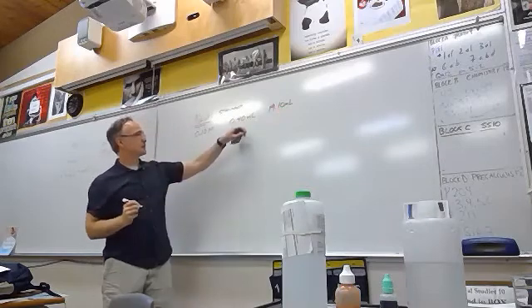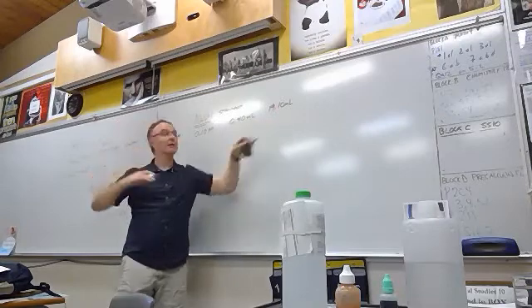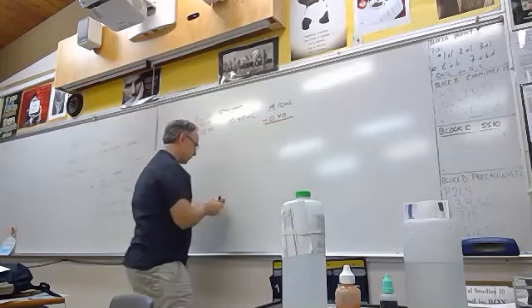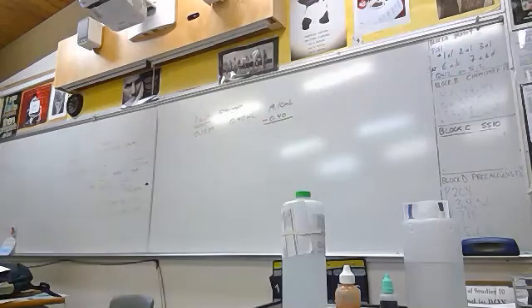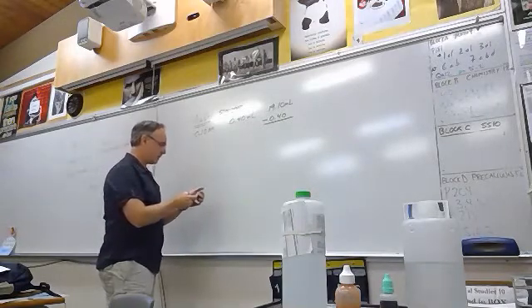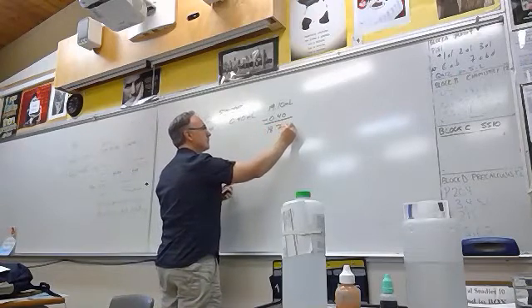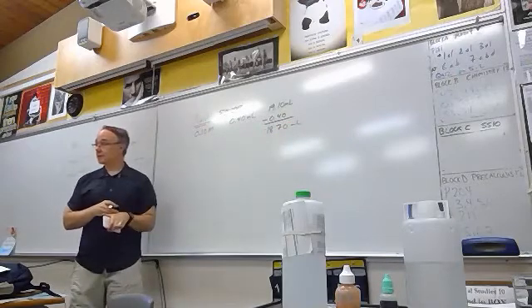So basically, we started with that amount, and that's how much we got. That's what we read after we did that. So we want to subtract these two numbers. So we go 19.1 minus 0.4. That gives me 18.70. Okay. Now that's the amount of base we had to neutralize the acid.